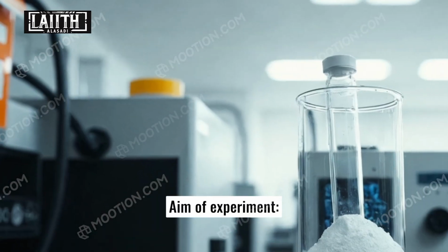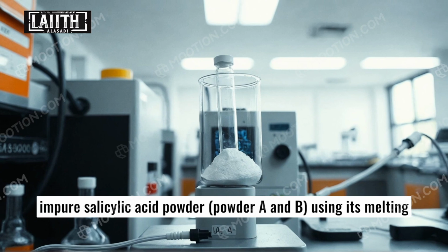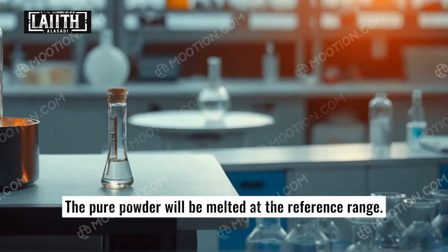Aim of experiment. Practical identification of 2 unknown samples of pure and impure salicylic acid powder, powder A and B, using their melting point. The pure powder will melt at the reference range.